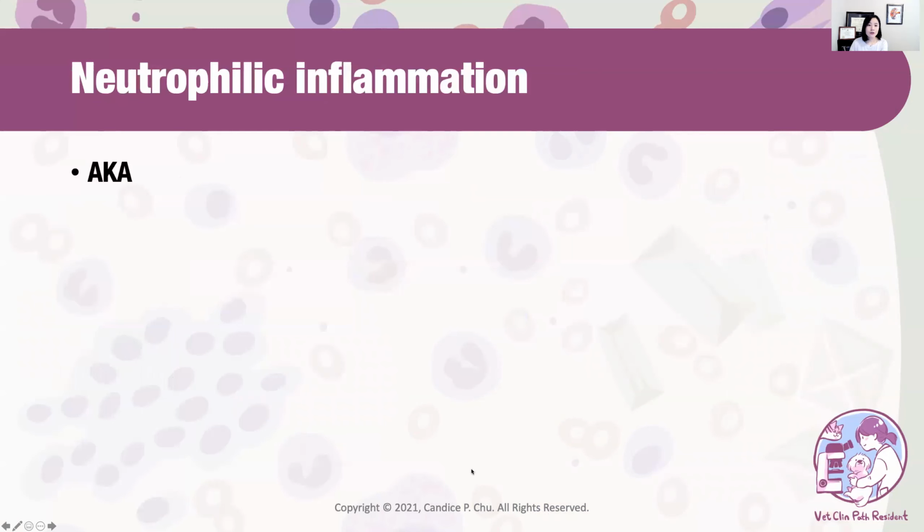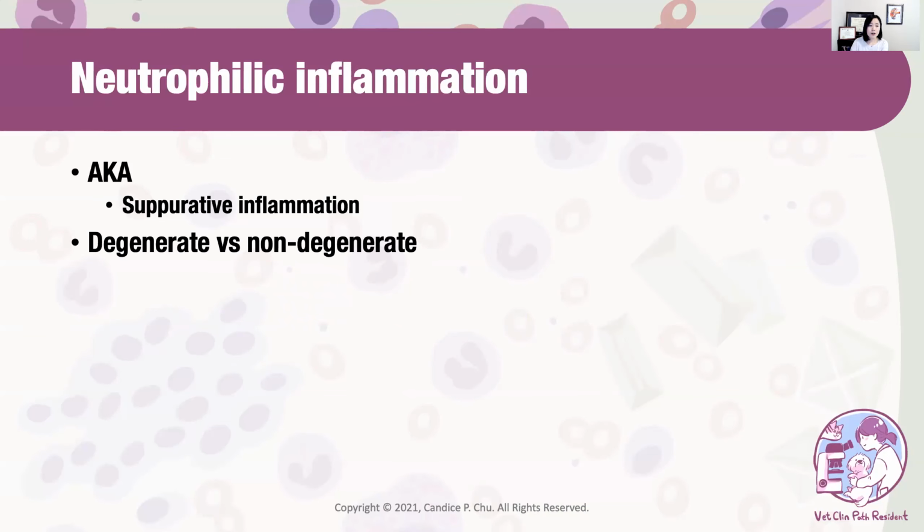All right, so neutrophilic inflammation, also known as suppurative inflammation. Every time we identify neutrophilic inflammation, we need to focus on the neutrophil morphology to determine whether these are degenerate versus non-degenerate neutrophils.